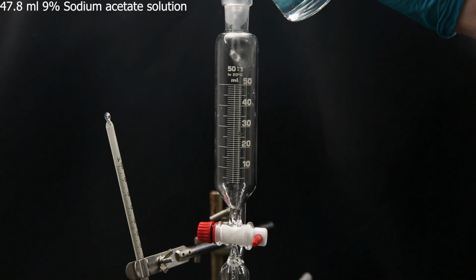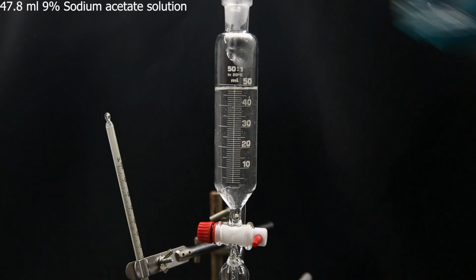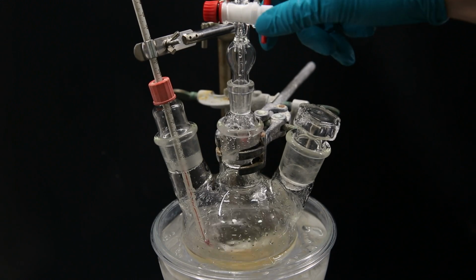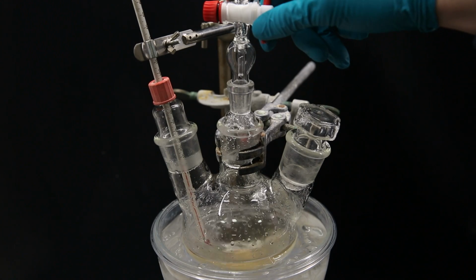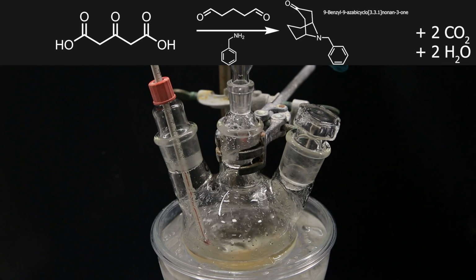Now to the dropping funnel, I add in 47.8 ml of a 9% sodium acetate solution. I dropwise add the solution to the flask, which will work as a buffer to stabilize the pH, and then leave it to stir. The full reaction is relatively complex, but the three reagents eventually form a cyclooctane ring containing a ketone with a nitrogen benzyl bridge in the middle, while also releasing CO2 and water.